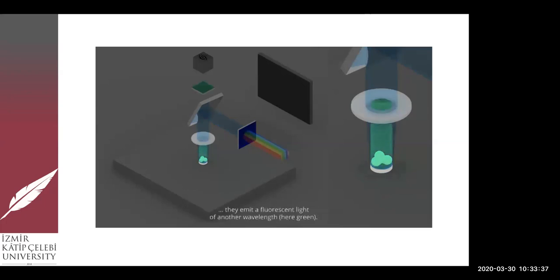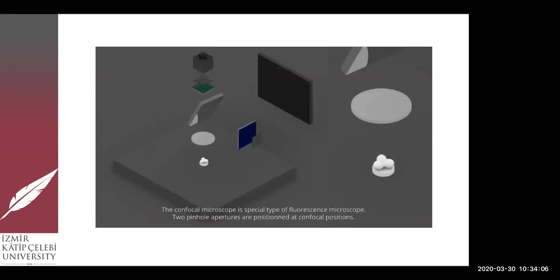We could see how it emitted fluorescence light that is visualized by the computer. We could see on the screen how the image is taken. Fluorescence microscopy shows us the sample as a whole unit, without getting into much deeper detail, and that's why confocal laser microscopy was invented in 1957.